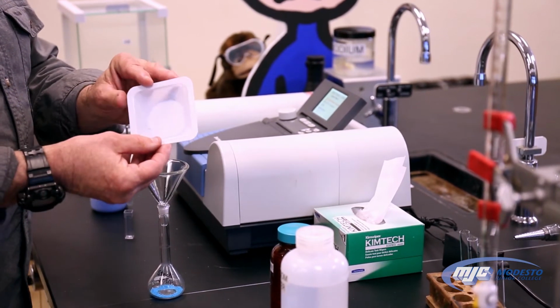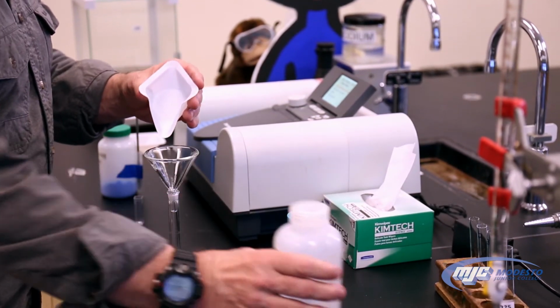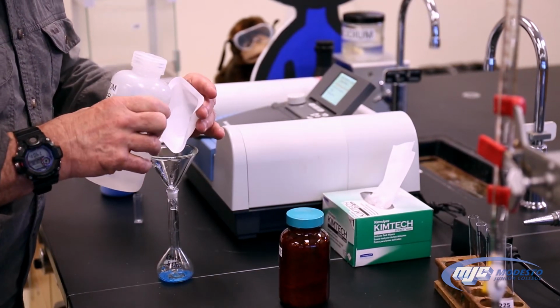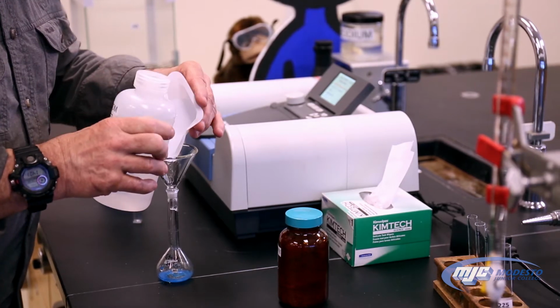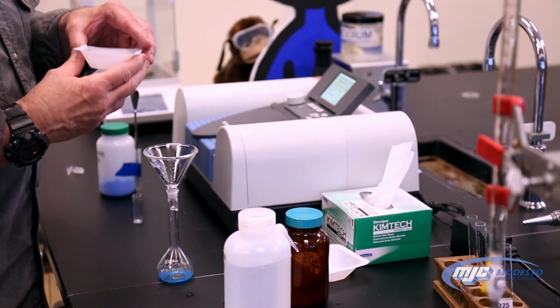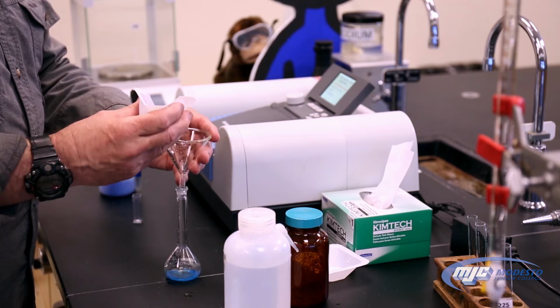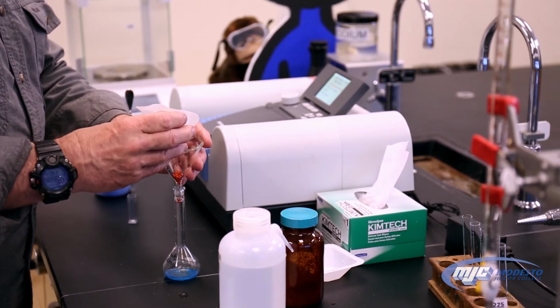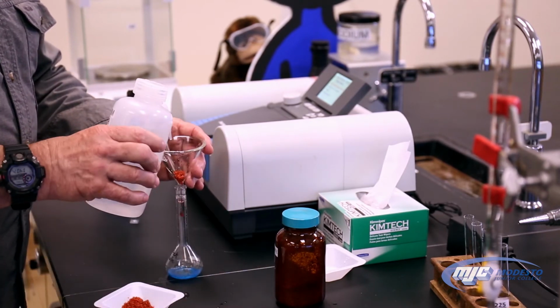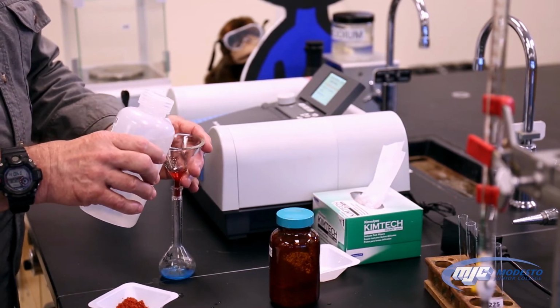Now there's still some copper 2 sulfate pentahydrate on there. We want to get as much of that off as we can. So we just take a little bit of DI water and rinse that down into the volumetric flask. Once we get that in, then we add the cobalt 2 nitrate hexahydrate. The reason we add this second is it's kind of lumpy and hard to get through the funnel, so we need some water. But it'll go through.